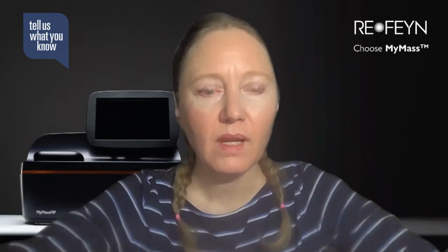Thank you. Well, first, can you tell us what are the biggest challenges in structural biology and why does sample quality so often determine success or failure? So, typical methods for determining structures are X-ray crystallography and cryo-electron microscopy. And they're really powerful techniques that have helped determine the structures of many biological complexes and macromolecules. But both heavily rely on sample quality because to get good quality structural data, you need to have very pure samples that are well qualified.